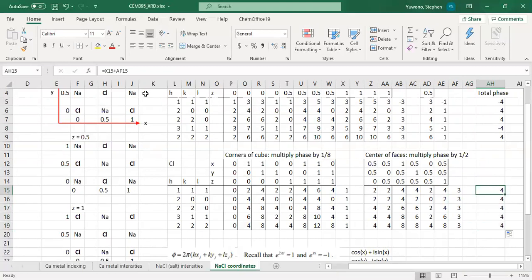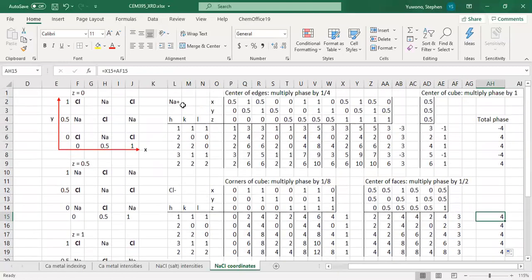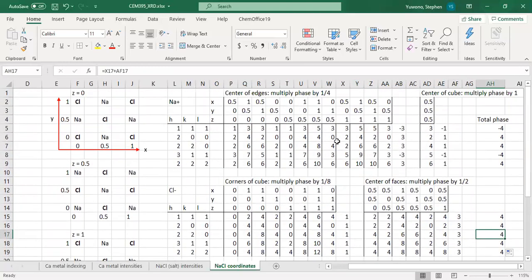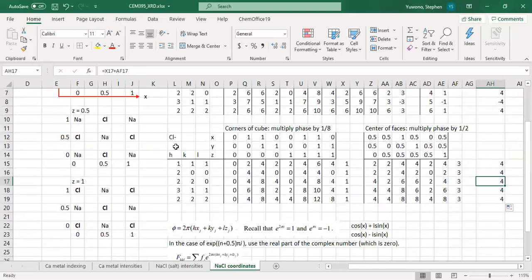All right. So this is the hard part. And the cool thing about this table is that if you try to do this table only for your metal sample, for example, you will find that it will have this kind of characteristic where all of the numbers will be positive for all the peaks that you have. However, let's say you have an FCC lattice, and we know that in FCC, your HKL indices have to be all odd or all even numbers.